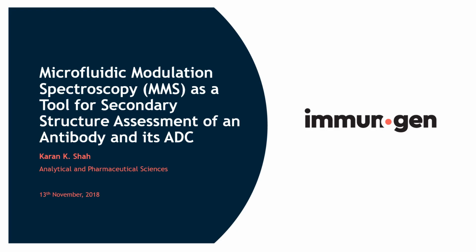Good morning. This is Karan Shah from Immunogen, and today I'm going to talk about using MMS as a tool for secondary structure assessment of antibody and their ADCs.